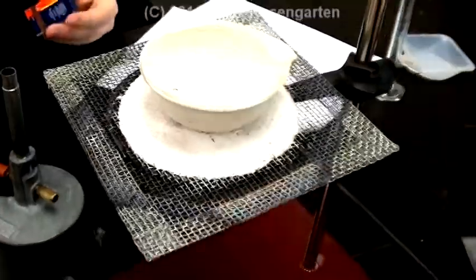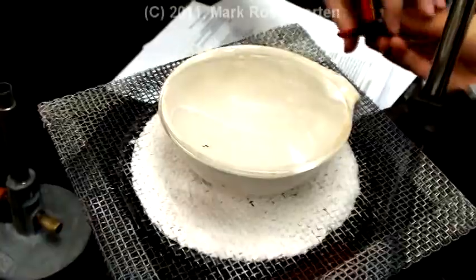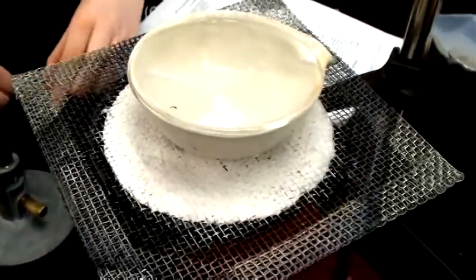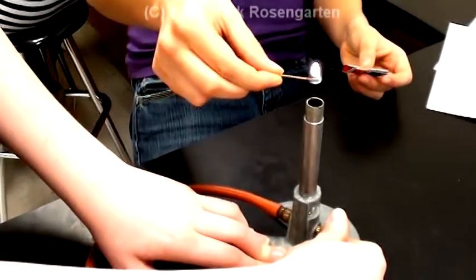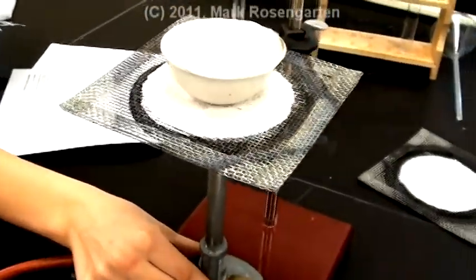Place the evaporating dish on a ringstand's wire gauze and place a watch glass on top of it, dippy side down to keep it secure. Light the Bunsen burner and place the Bunsen burner underneath the dish to heat.